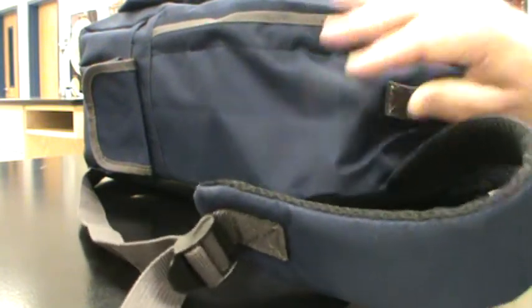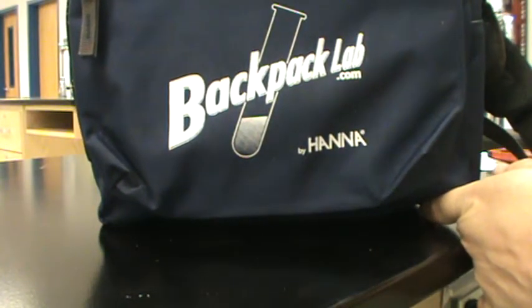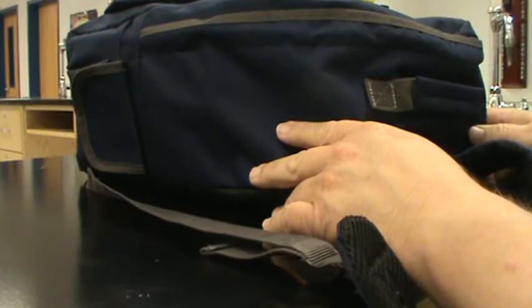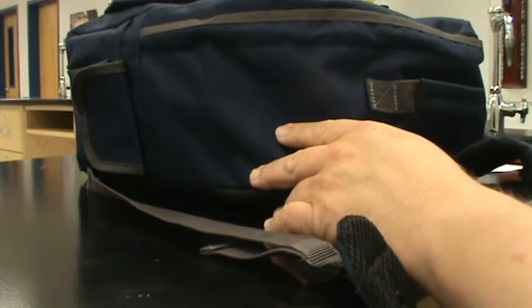What you see in front of you here, this is called, let's see if I can get this where you can see it. Yep, there we go. This is called a backpack lab, and it comes to us from the Hanna Laboratories. The object of this exercise is that you can carry this out into the field and you can perform tests on the quality of water if you're studying the environment and the effect of pollution on water or the effect of runoff or fertilizer or whatever. I use this in the laboratory because this becomes equipped with several different experiments which we will be doing.